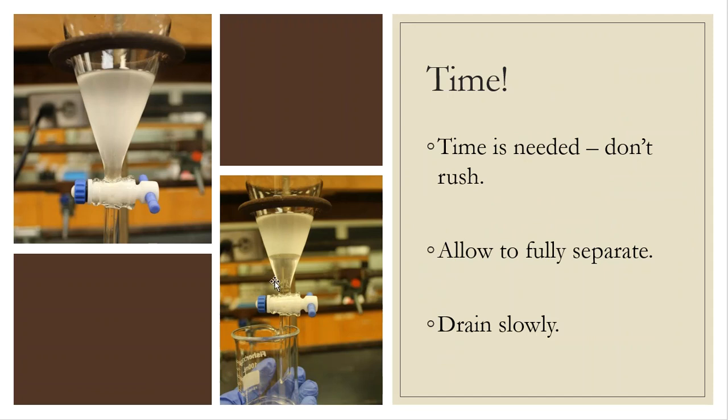Okay, so over time, I see this separation get a little bit better, a little bit more defined, and I begin to drain off that bottom layer. That bottom layer is my methylene chloride layer. This is my DCM layer.